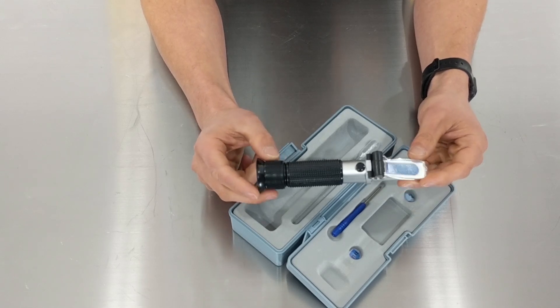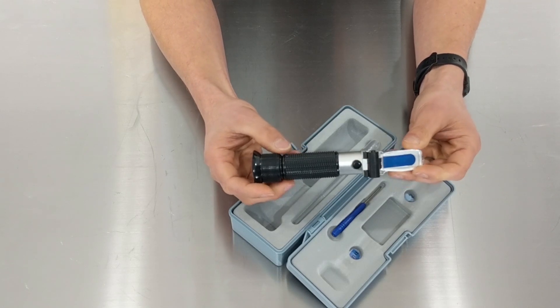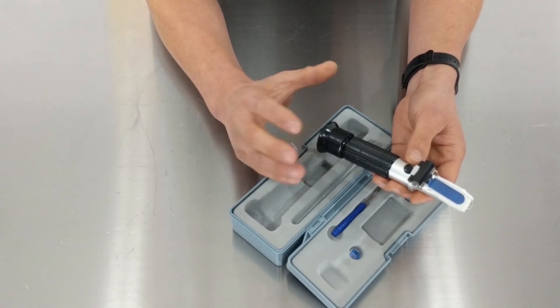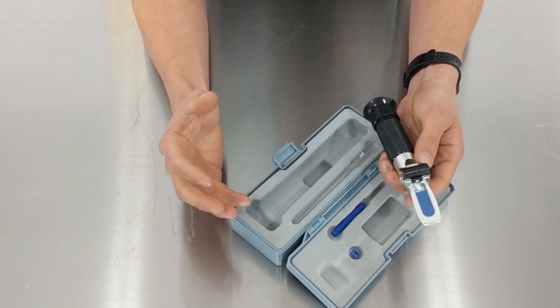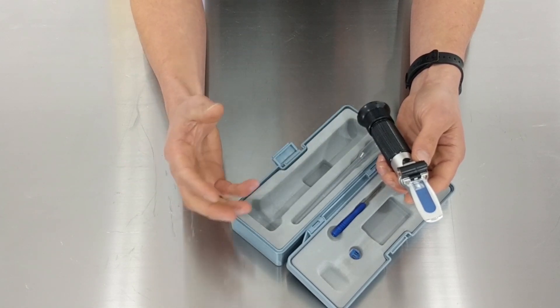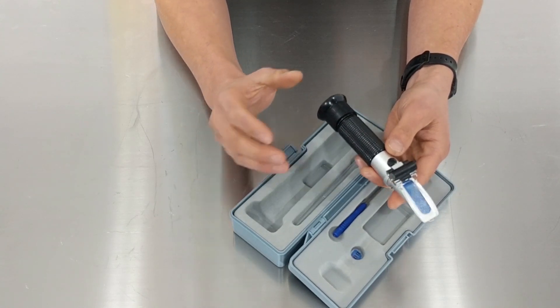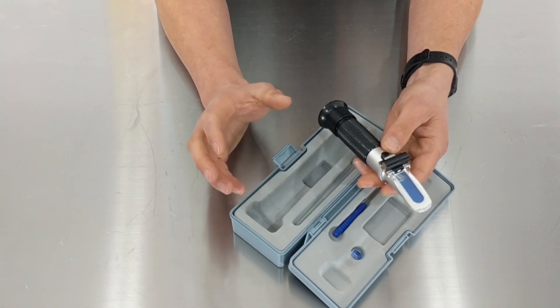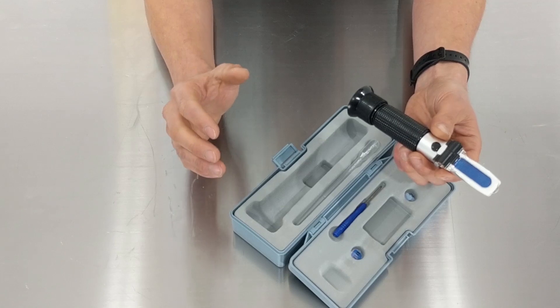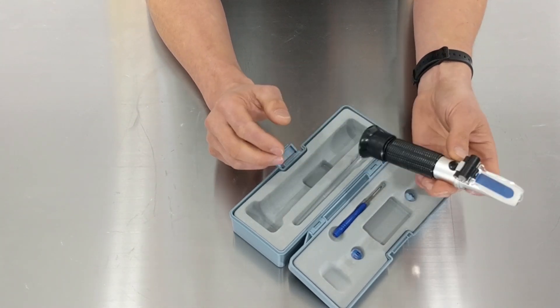For a lot of you newbies out there, I just want to explain that this tool is generally used for taking gravity readings prior to fermentation. Once fermentation takes place, you've got not just sugar and water but also alcohol, and the alcohol tends to put the reading out. Unless you use some type of formulation or online calculator to account for that, you're not going to get an accurate reading after fermentation. Sometimes newbies use a refractometer during fermentation, get incorrect readings, and can't work out why.